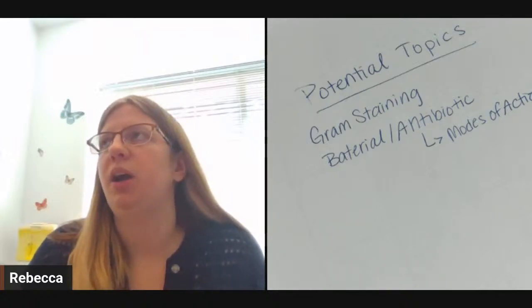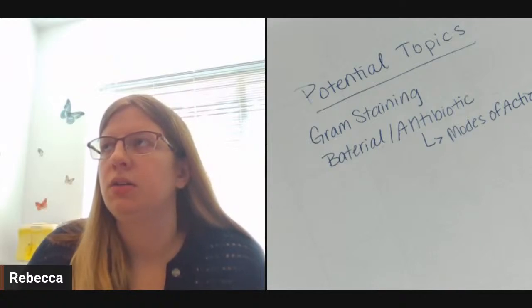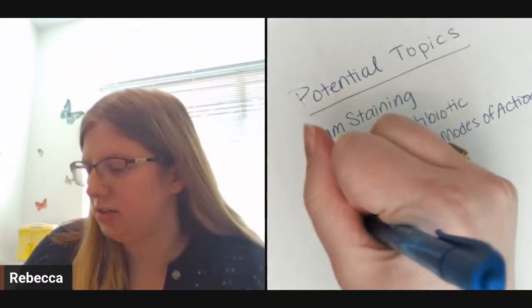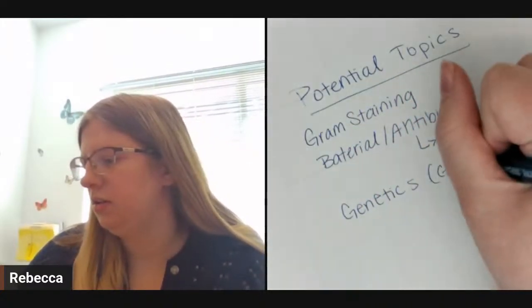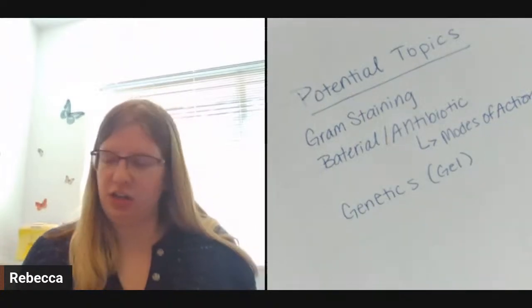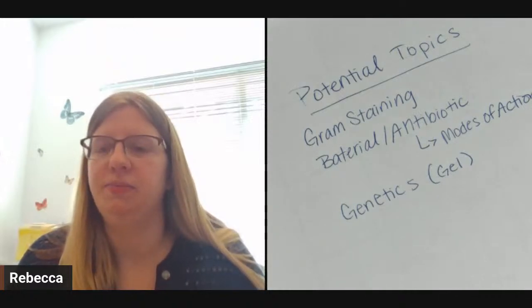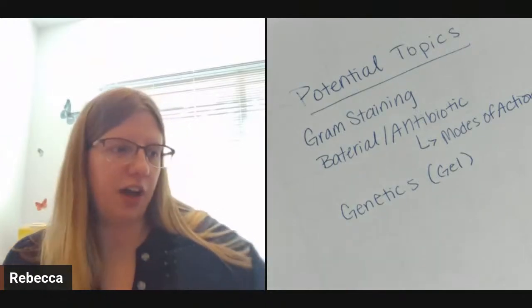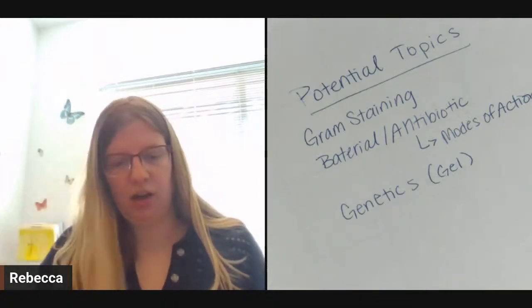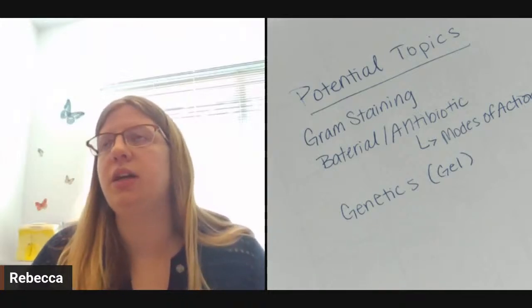Let's see, what else was on the mini practical that we had? So there was some genetics practice, right? That was looking at the gel, and that gel was a gel electrophoresis, right? And so determining inheritance, like a lot of times we look at a gel for who is the father of an individual, right? Let's see, what else would have been on the mini practical that you guys had.